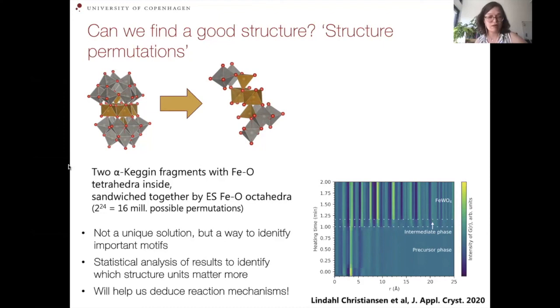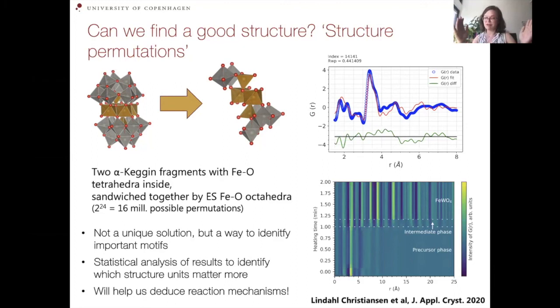So this here has 24 atoms or groups. What we're basically trying to do is remove some of them at a time and see whether that improves the fit or decreases the quality of the fit. Then we see what clusters come out of this and what they have in common. I think I have a fit here; we'll try all these different kinds of clusters and then see what works and what doesn't work. And from that, we can learn about what structural motifs are important in this.